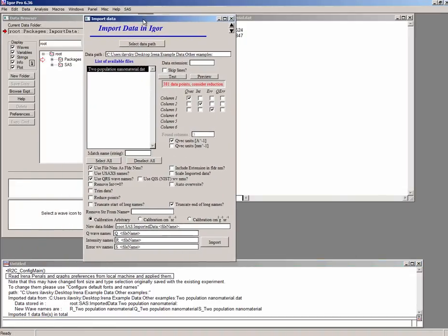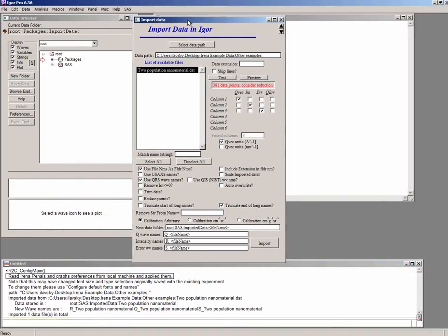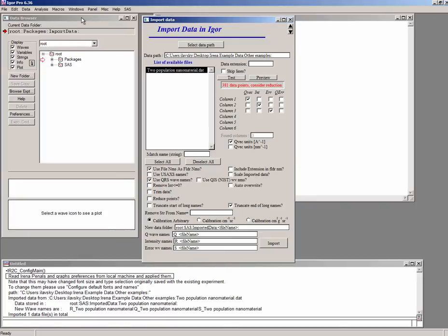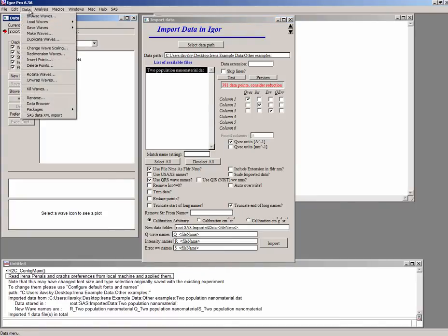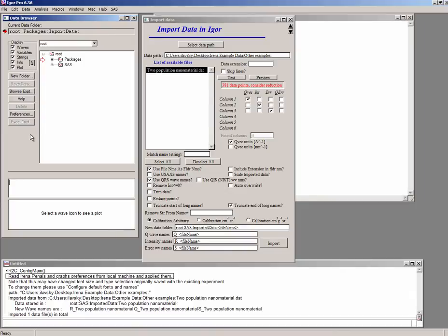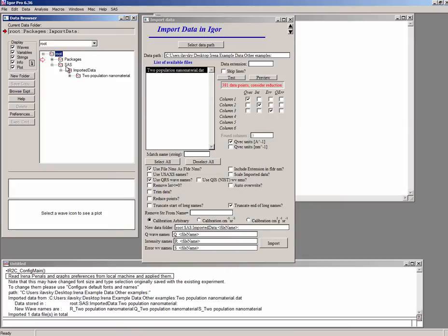If you look on that, there is a data browser. If you don't have it, you can find it in data, data browser. This is a view inside the Igor experiment itself. You don't care about anything which is inside packages folder. What you care about is the data we imported, which is the SAS imported data. And out here you can see that there's two population nanomaterial.